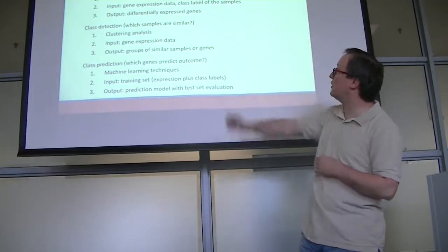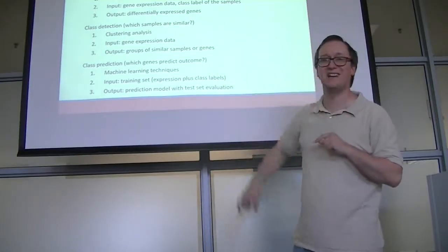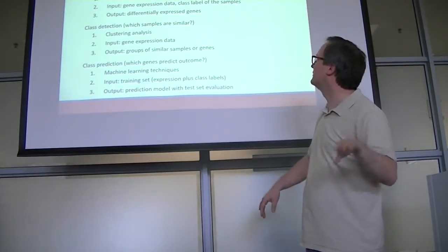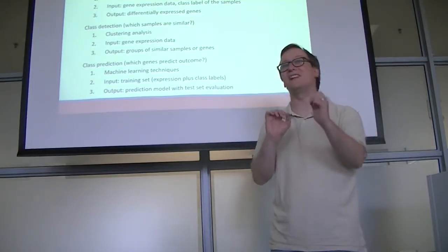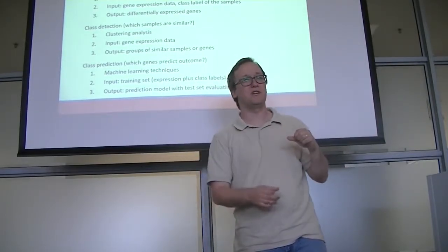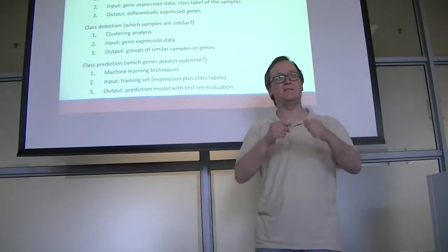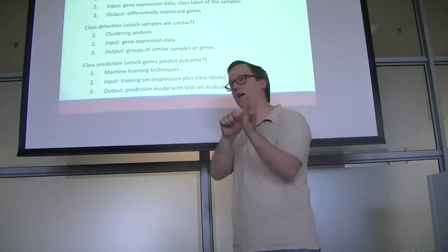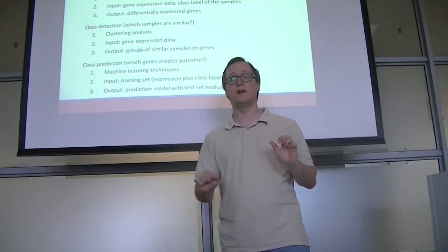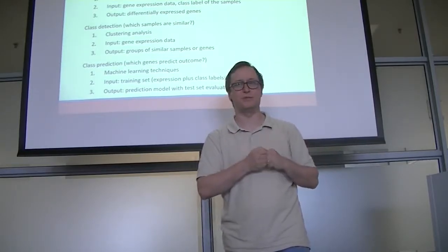Okay, so this is called a differential expression analysis. That's all great. Our input is not only the gene expression data, but a kind of metadata. Metadata, that's a term we didn't talk about here. I talk about it a whole lot in the 8 days stuff. So we have not just the microarrays, but we have a class label on each one. So for each microarray data set we produce for our differential expression analysis, we're going to indicate this is a cancer or this isn't a cancer. And from that, we're going to get a list of genes that are the best ones to tell us which genes are those that differ the most between these 2 cohorts. All right, so that's kind of the most commonplace kind of analysis that we do in differential gene expression.